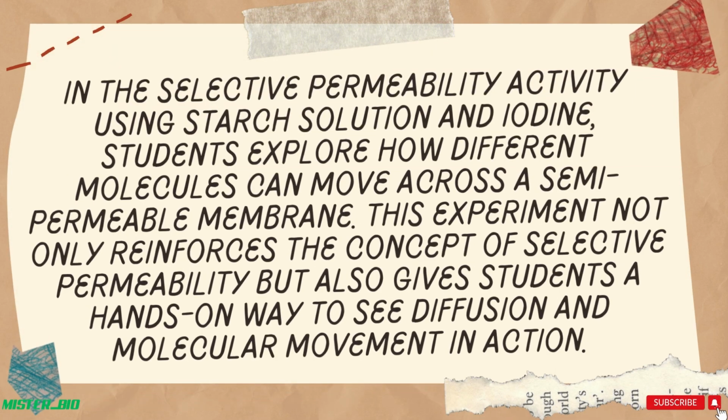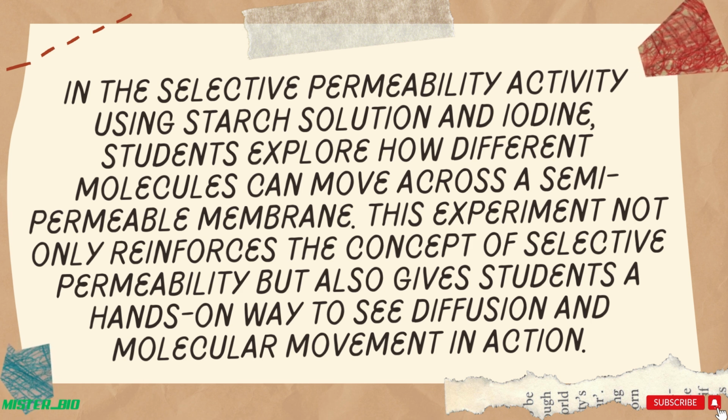In the selective permeability activity using starch solution and iodine, students explore how different molecules can move across a semi-permeable membrane. This experiment not only reinforces the concept of selective permeability, but also gives students a hands-on way to see diffusion and molecular movement in action.